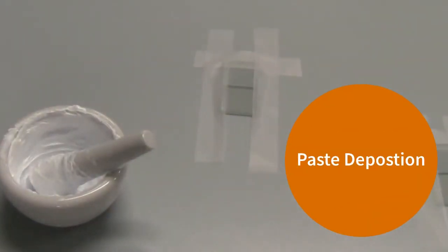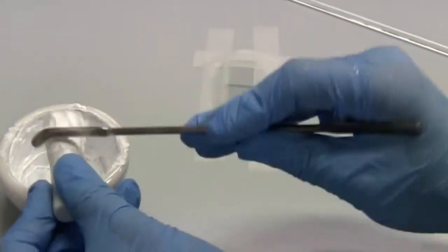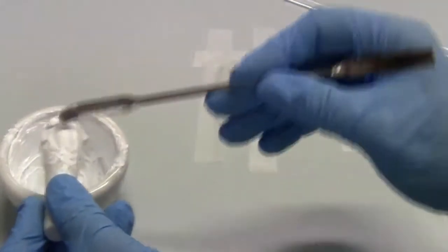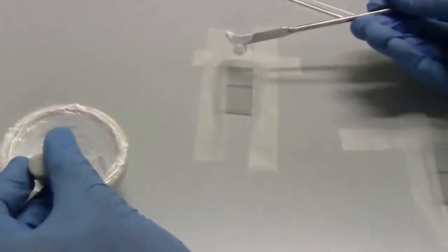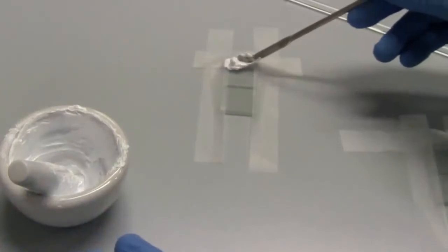Now we can start with the deposition, and we can take part of the material from the pestle or from the mortar, depending on which point you can find a good quantity of material, obviously by cleaning the spatula and the rod before doing the work. And we can deposit a reasonable quantity of this paste over the portion of the slide which is covered by the tape.